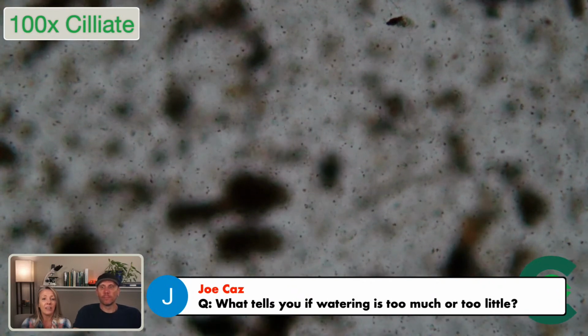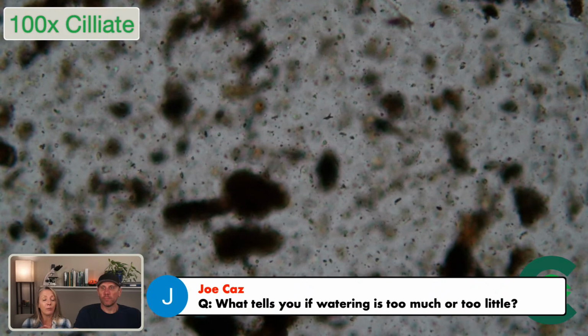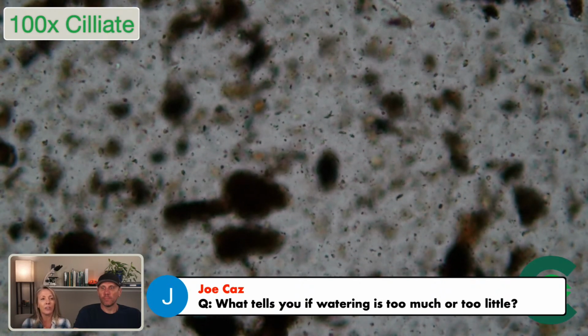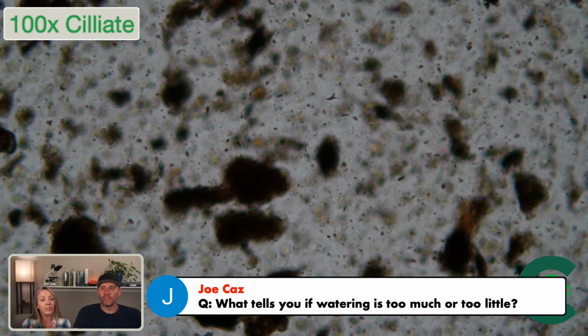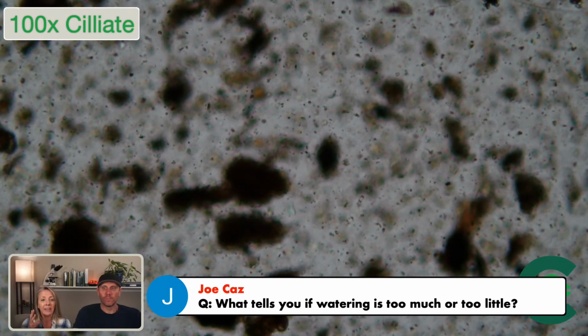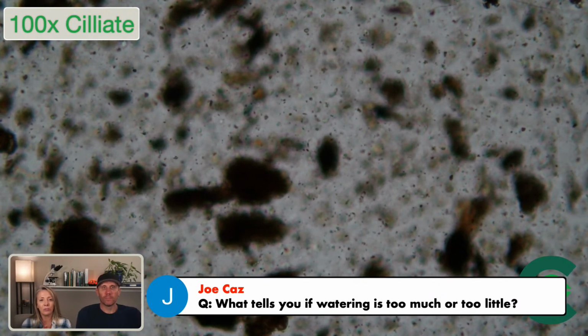This is going to be a ciliate, basically. I know this because I've been doing this a lot, but in order for you to actually identify it, you would need to rotate into the 40x objective for a 400x total magnification. But the way that he's moves like this, you just don't see in other organisms.